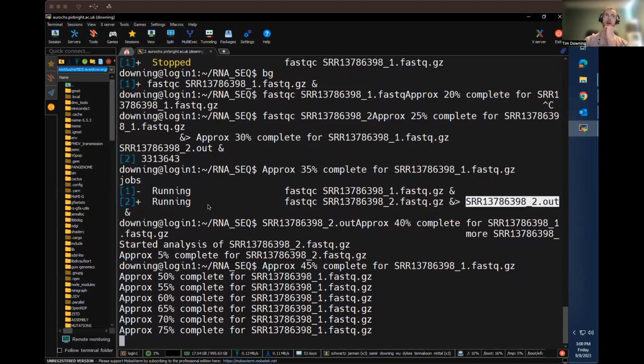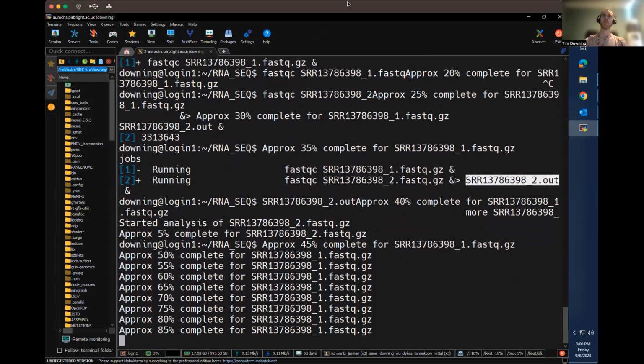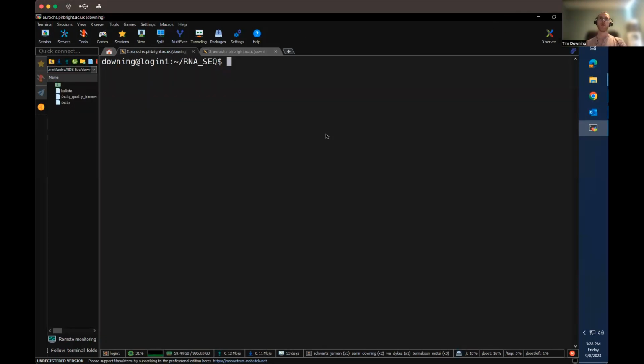What we'll do at the end of when this is run is take our FastQ file and run the FastX quality trimmer on that. So then if we look at our files for that particular sample, we have an HTML file and a zip file that is generated by FastQC. We should be able to see them for this particular sample.